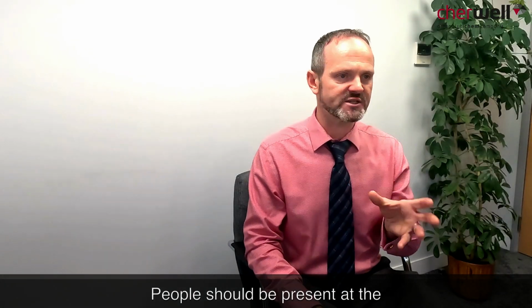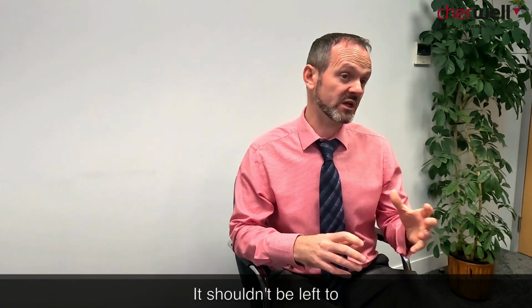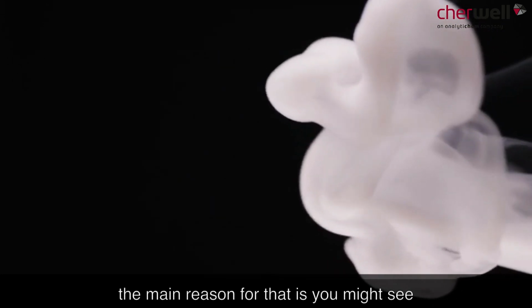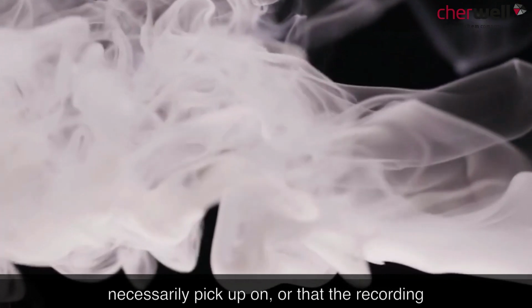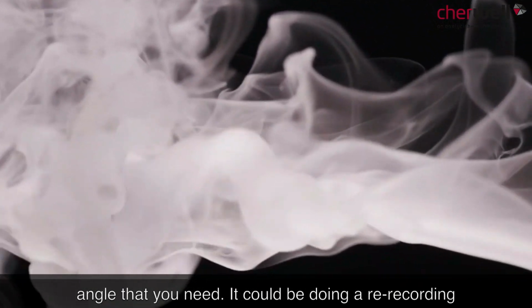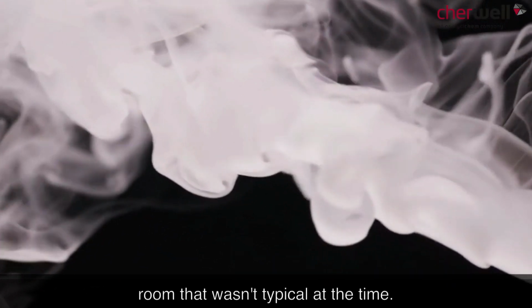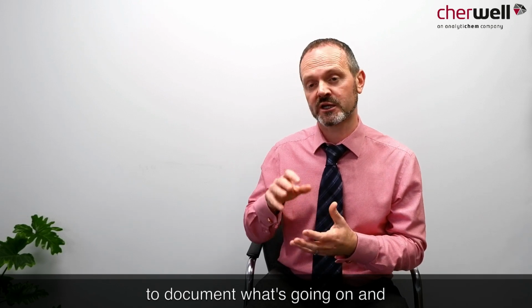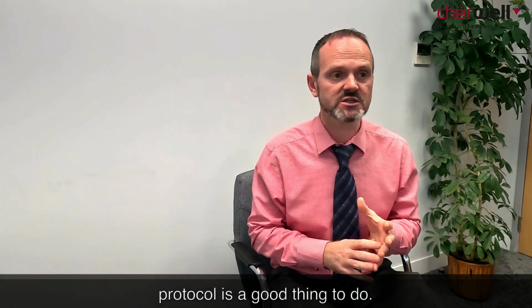People should be present at the time, there in the room when you're doing these studies, to be able to document it as well. It shouldn't be left to some time later to understand what the output of those videos or recordings are. The main reason for that is you might see things at the time that the camera or the recording doesn't pick up on. It could be a different angle that you need. It could be doing a re-recording because perhaps there was something in the room that wasn't typical at the time. So having people there at the time of the study to document what's going on and capturing that in your airflow visualization protocol is a good thing to do. It's a good thing to document.